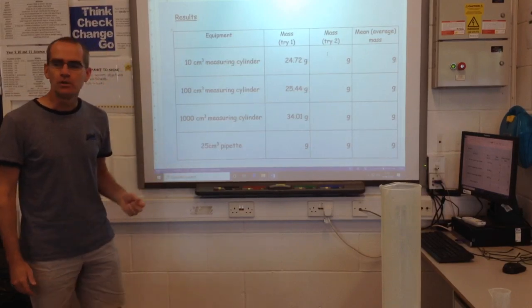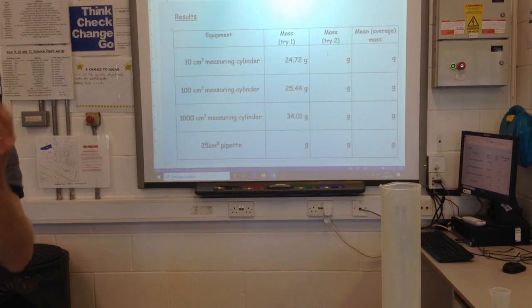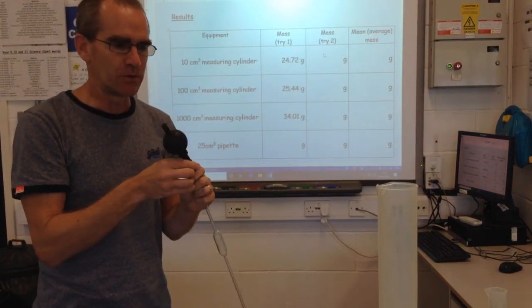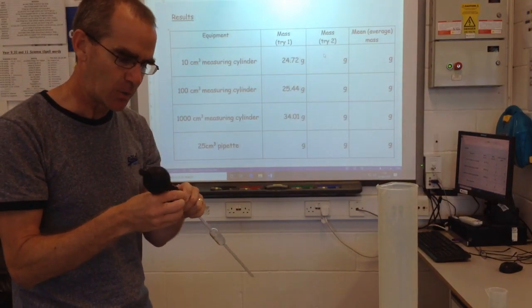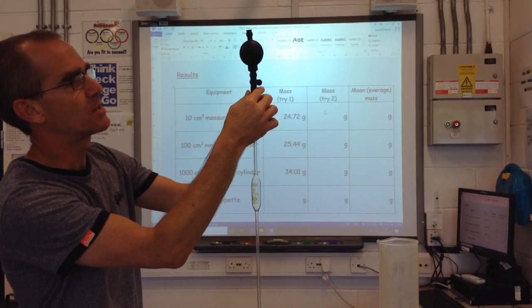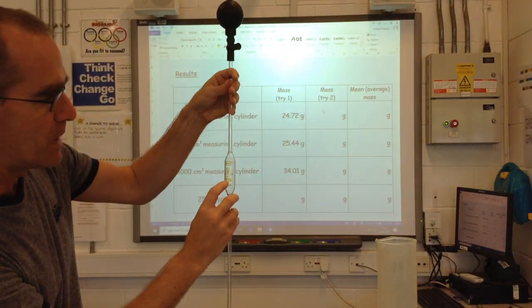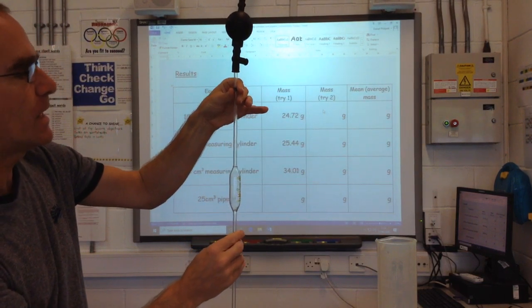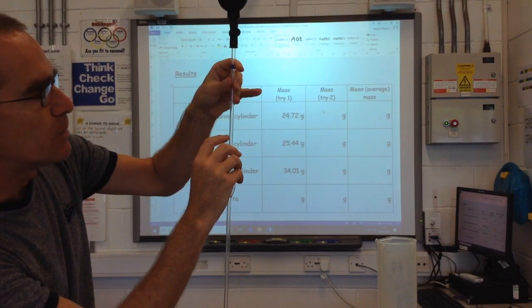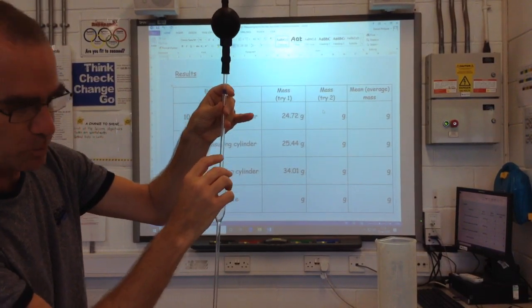There's one more piece of equipment I'm going to show you — you won't normally use this until year ten. It's called a twenty-five centimetre cubed pipette. Normally you would use this to measure out exactly twenty-five centimetres cubed of a substance like sodium hydroxide, but for now we're just going to use water. The pipette comes in two parts: the glass pipette itself, and a pipette filler bulb. It's quite an expensive piece of kit. It's deliberately produced so that it will measure exactly twenty-five centimetres cubed — that is all it's any good for. There is a little marker which I'm going to try to fill the pipette up to.